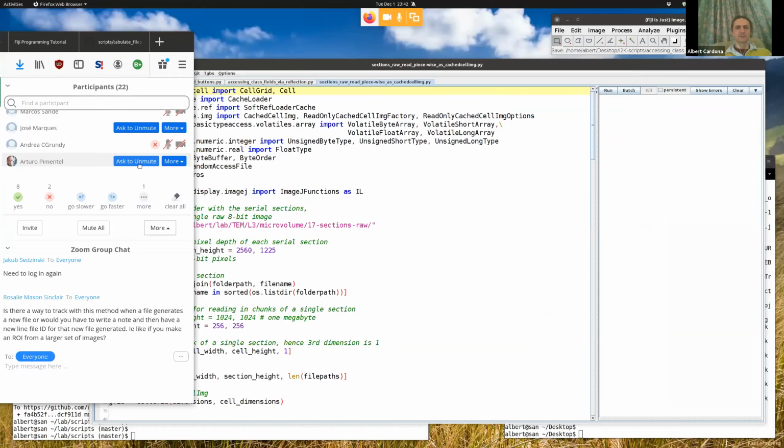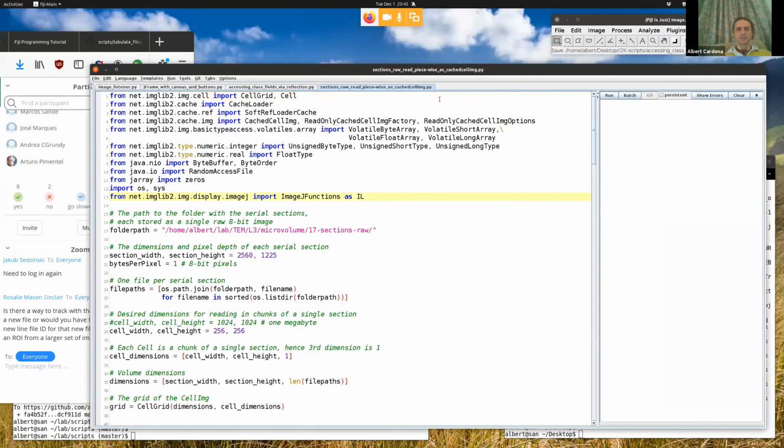All right, so now the one I wanted to show you is less on UI and more on heavy-duty stuff. So let's see if I can find it. Right. So what does this script do? Picture this.